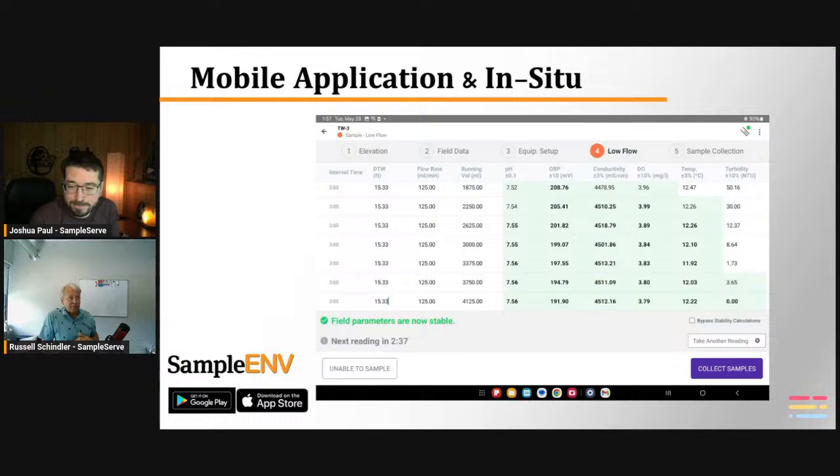Maybe even get a third one going. And then by the time you get in the assembly line of low flow sampling. Right. Yeah. And then you go back, fill up the bottles, the sample containers, but you've recorded all the data that you need to collect, and you're able to kind of maximize your productivity out in the field.